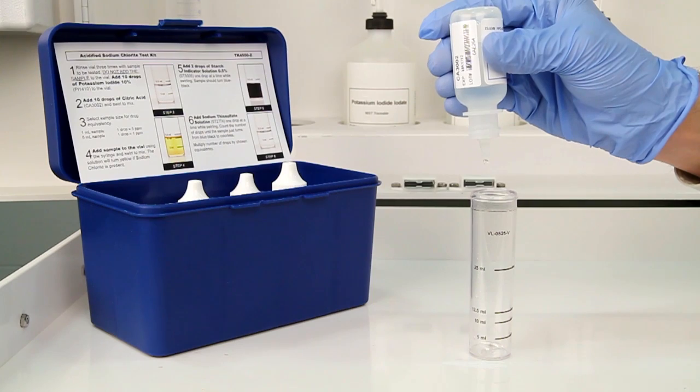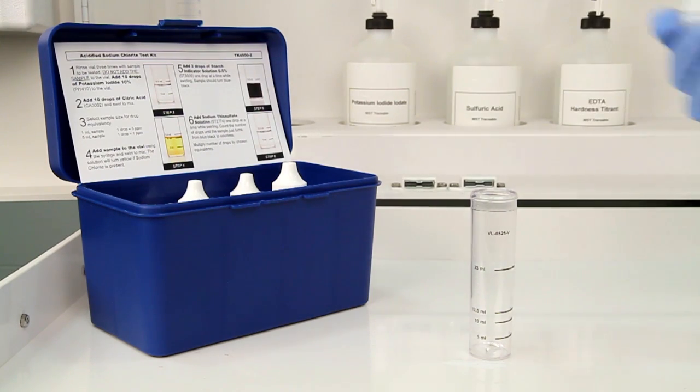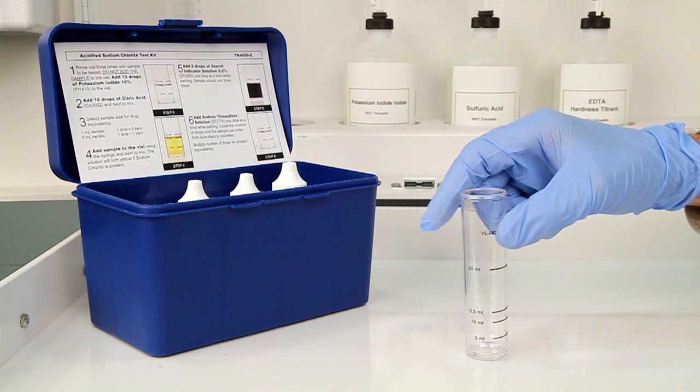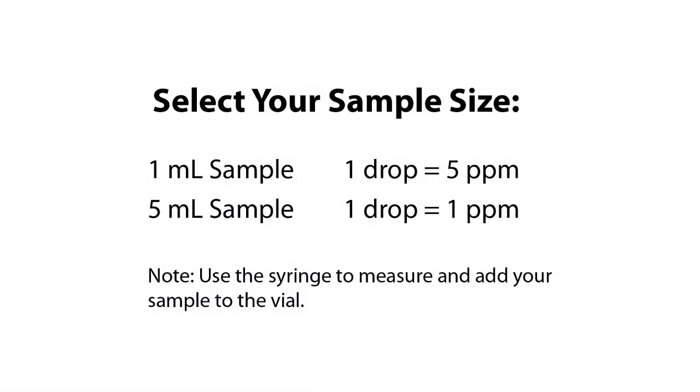After the addition of each reagent, swirl the vial to make sure the reagents are properly mixed. The next step is to choose your sample size based on your desired drop equivalency.